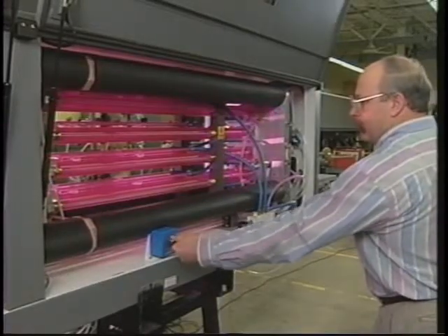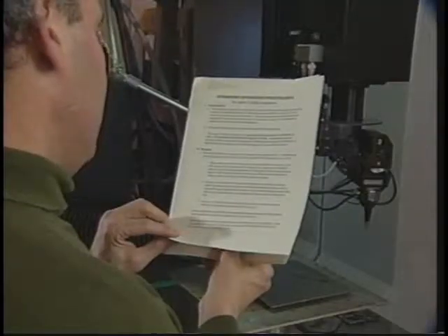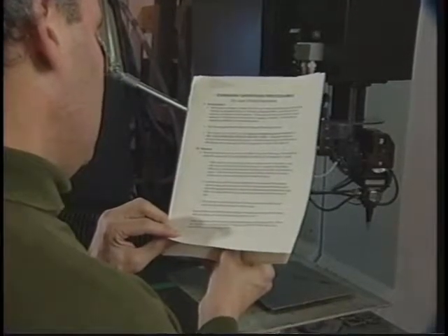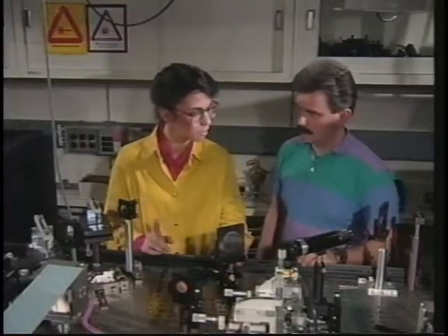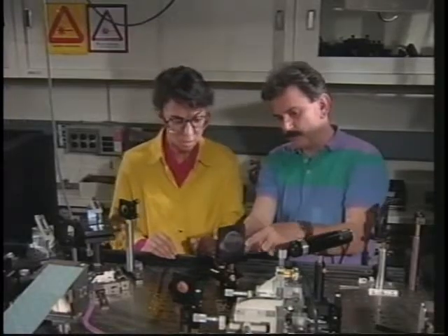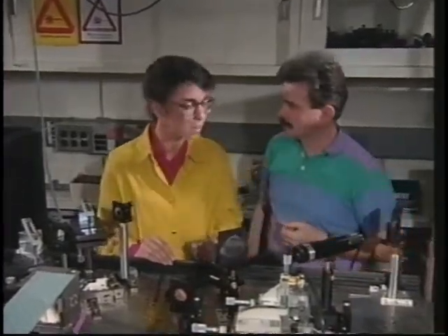Only qualified and authorized personnel should operate lasers. Follow all standard operating procedures. These procedures should be written in consultation with your laser safety officer. In particular, they should identify all potential hazards. A complete standard operating procedure must also indicate the level of training required for the laser in question.